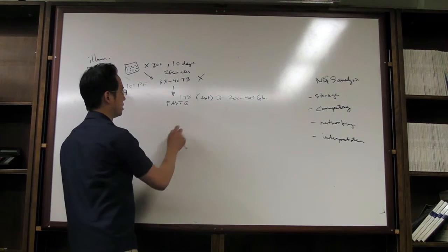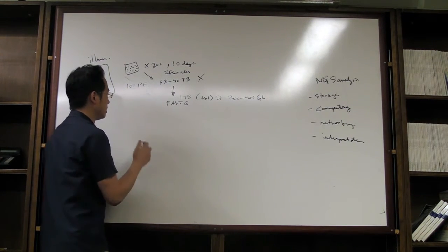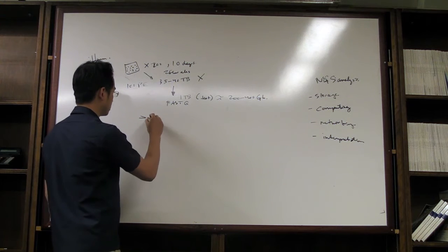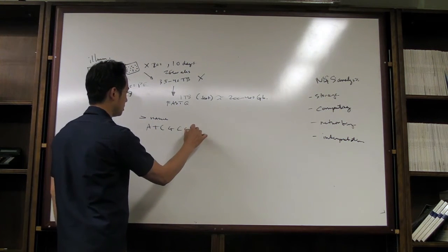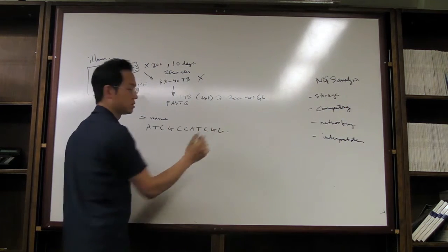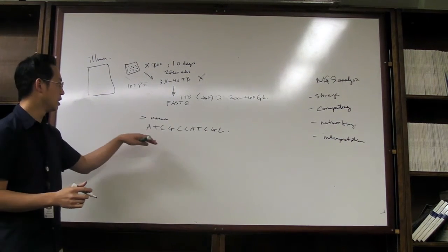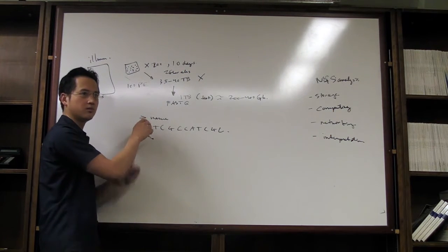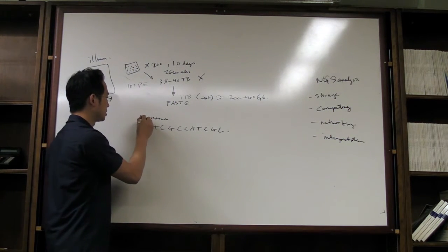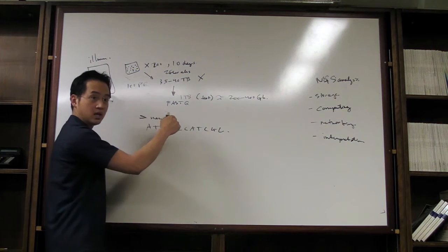So you get this back, and so what is FastQ? In the old days, a FASTA file is essentially a name of a sequence, and then your A, T, C, G, C, C, A. Something like that. A FastQ looks a little bit fancier. I think there are different characters that are built into here, but essentially it has a sequence name again.